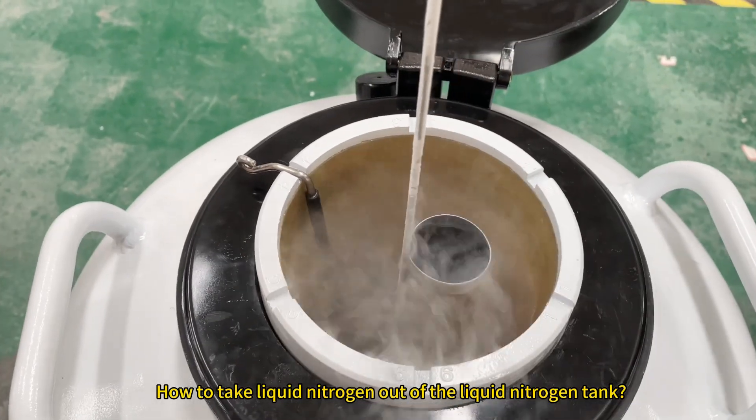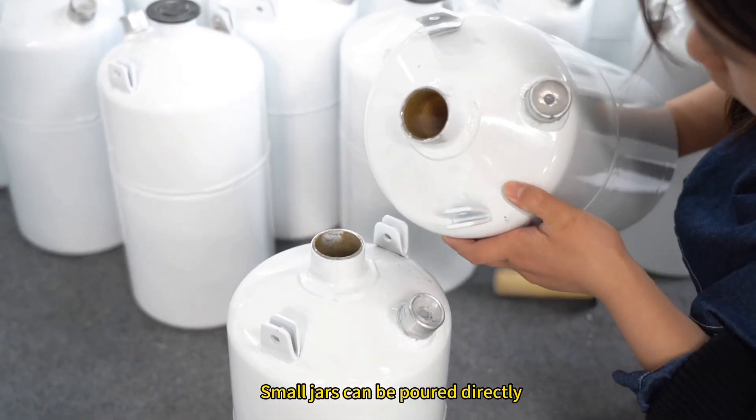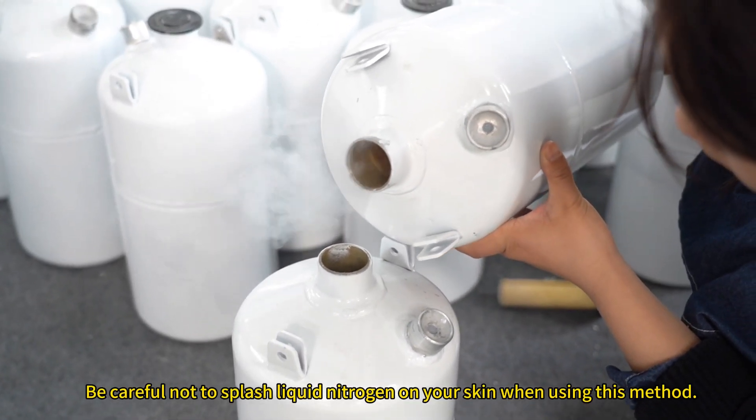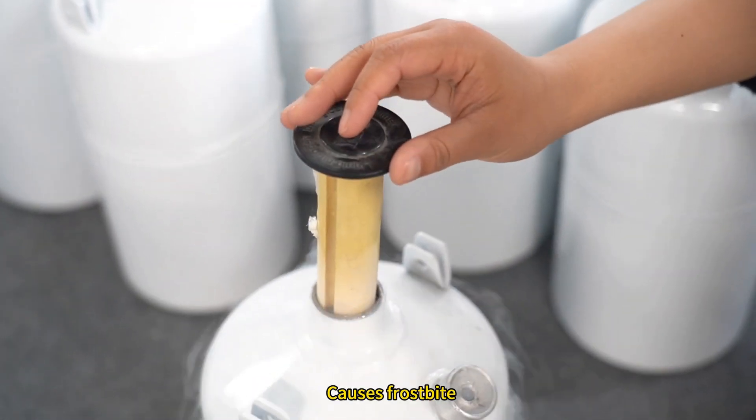How to take liquid nitrogen out of the liquid nitrogen tank? There are two ways. The first: small jars can be poured directly. Be careful not to splash liquid nitrogen on your skin when using this method, as it causes frostbite.